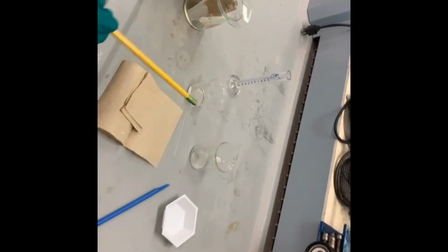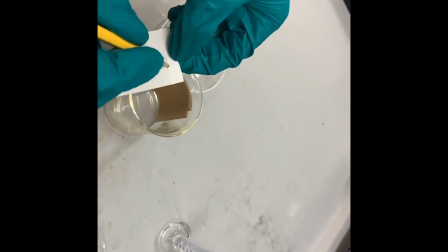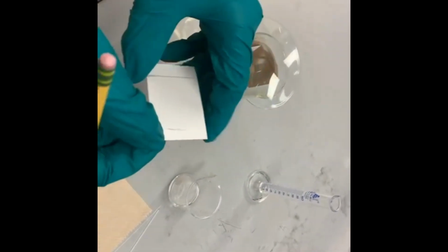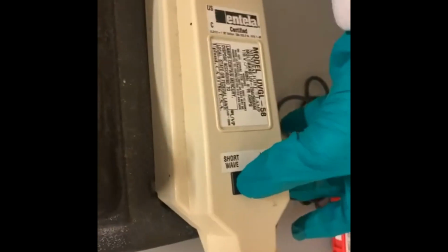So once it's close to the top, you can now take the TLC off and draw a line where the solvent ended, and then now you can go to the UV light to see how far your compound traveled. So this is the UV lamp. We're gonna put the TLC under, hit short wave, and this spot right here, it's our compound. And this is how you would basically perform a TLC preparation of any compound you have to do in lab.